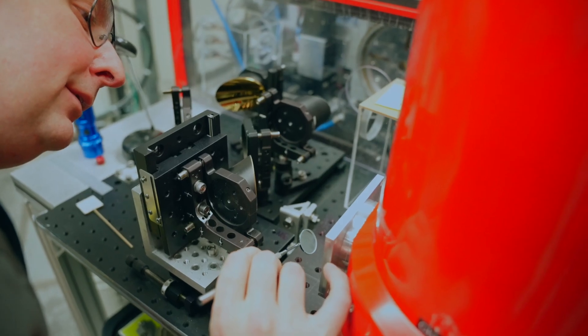I'm Brent Billinghurst. I am the beamline responsible for the Far Infrared Beamline here at the Canadian Light Source.